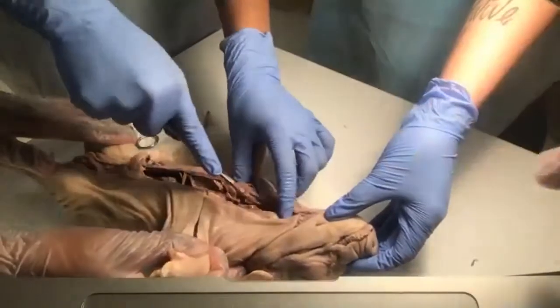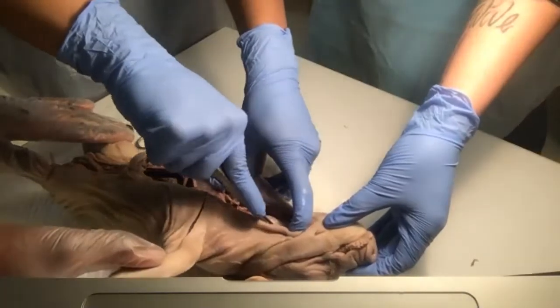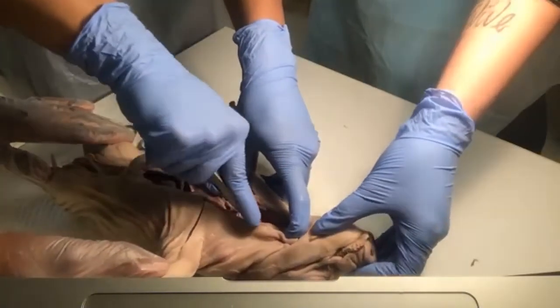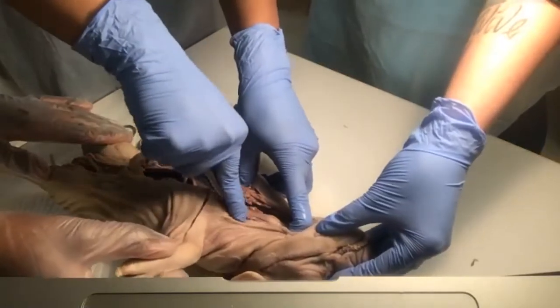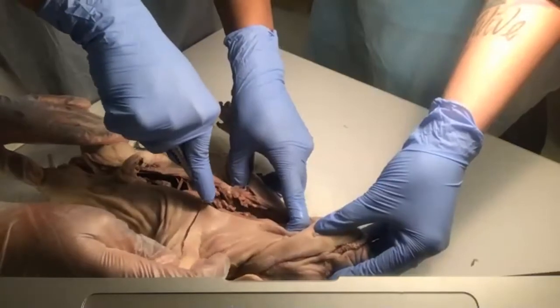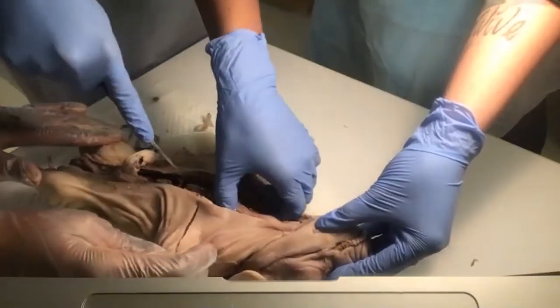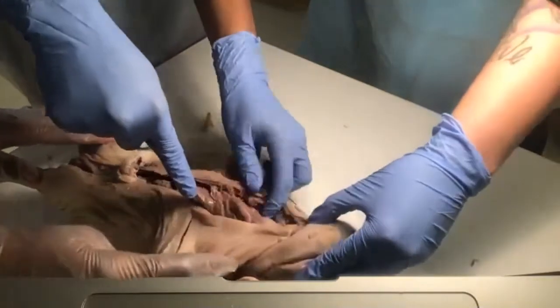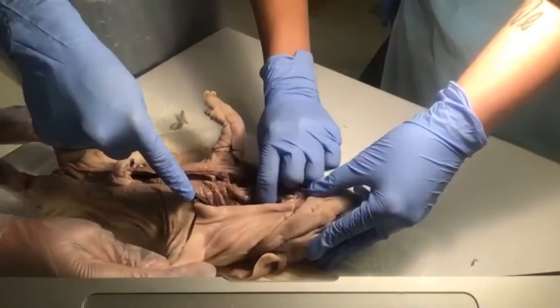So you feel that kind of knot, and there's tubes associated with it. Cut all of that out too. Because now the next part is, we want to look for the epiglottis. Of course, the larynx, which is the voice box, and the two tubes associated with the larynx, which is your trachea and your esophagus.